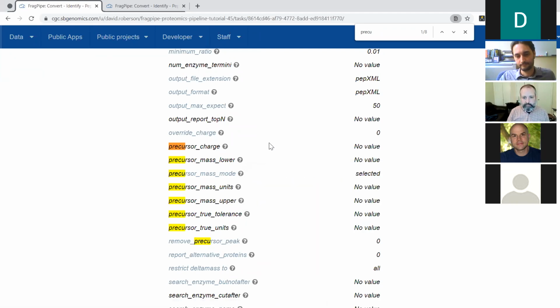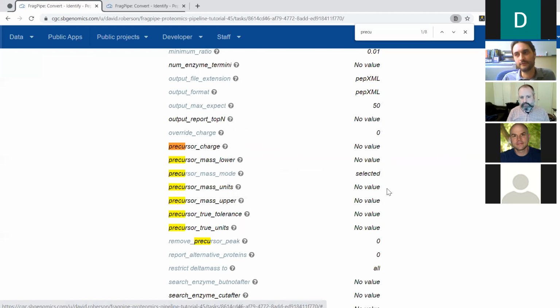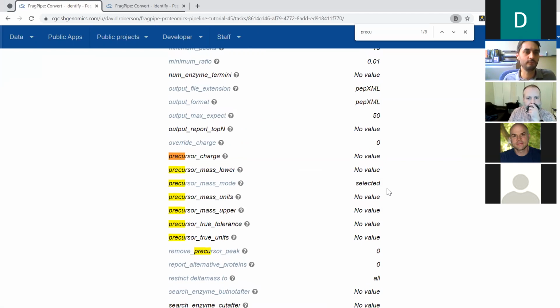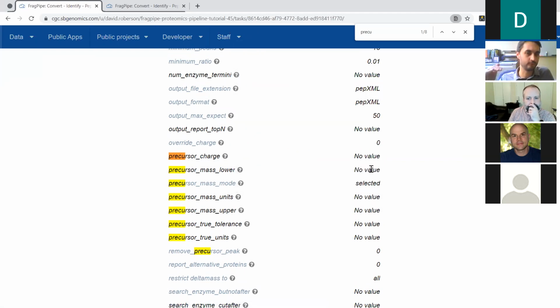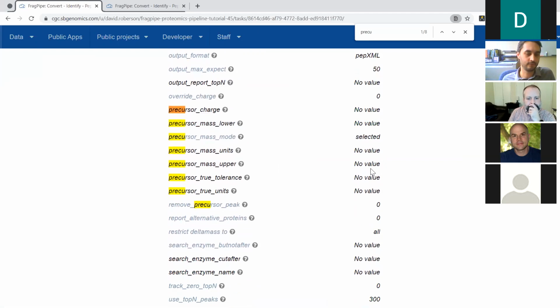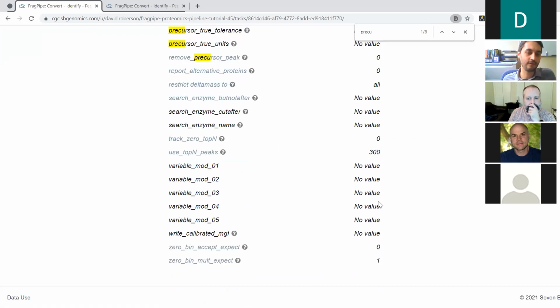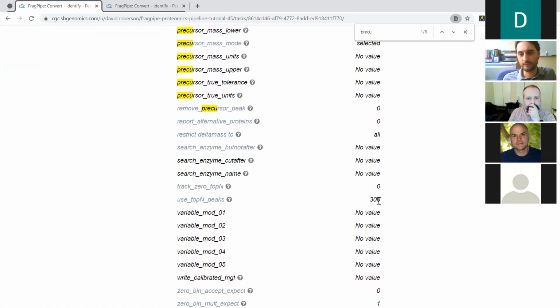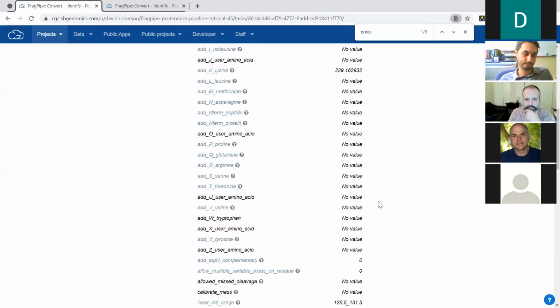Okay. The tools that we have here for this workflow received the same default values as the tools you would run on your own computer. When you download the tool and open the parameter file, it already has a lot of those values filled with the defaults, and the same thing happens here. But I think it's not showing because those values are at the workflow, not the tool, right? Yep. Got it. Okay. Thank you.